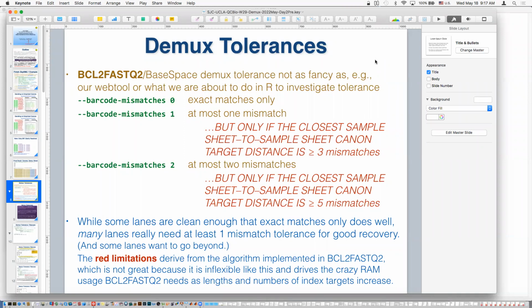And it's very simple, like we were talking about yesterday. For each one, you compare it to all the others and find the smallest distance to any of the others, and then your candidates are exactly those. For the index checker, it just gives you the list of all the ones with the smallest distance. If you're actually doing demux in that world, you would probably consider reads that are closest to more than one at the same time to be demux fail or ambiguous, and you would not demux them. If at the minimum distance it's a unique one that it goes to, that's the pile you would put them in. Now maybe if the distance gets high, you don't really want to accept it, because if it's 5 mismatches away from the nearest expected, it's probably not a match.